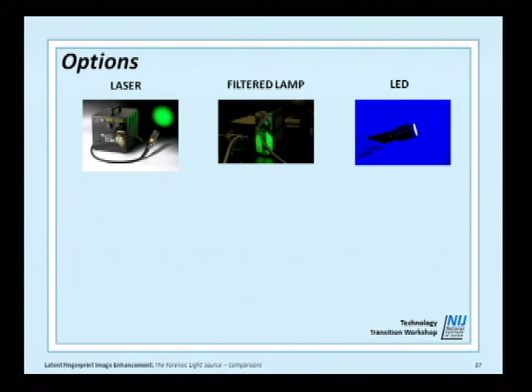But under the option of dollars, because the laser has shrunk in price, they have a smaller version of the laser we were just talking about at the last break. The prototype, or the one that first hit the market, was variously 6 and 8 watts.